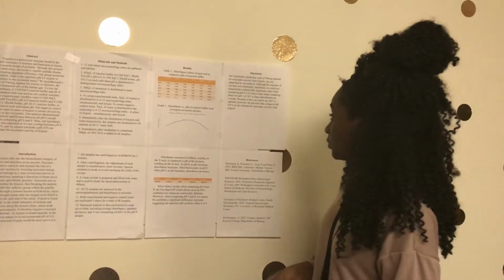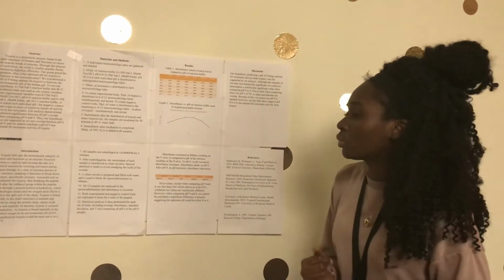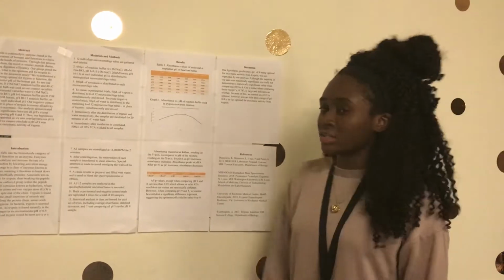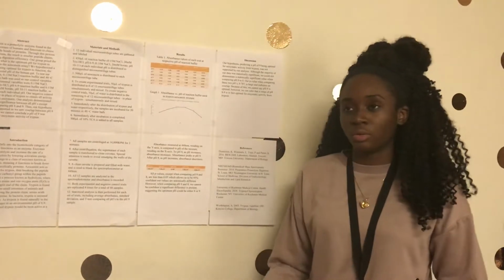So as I said before, we couldn't particularly say pH 9 was the optimum pH value for trypsin to act on azocasein. So we based it on approximately pH 8 to pH 9, either of them being the best optimal value for trypsin to act on azocasein.